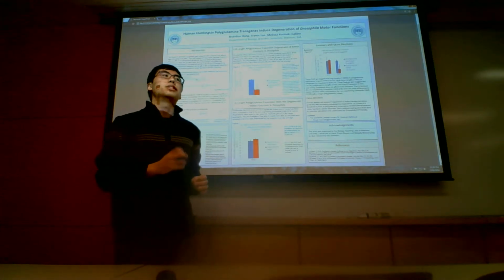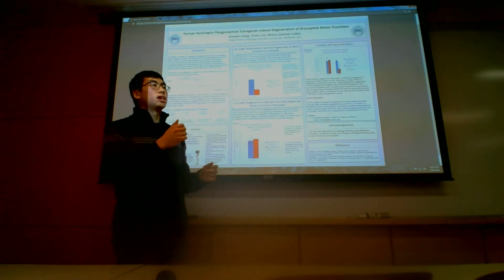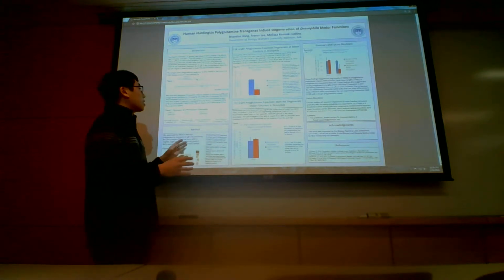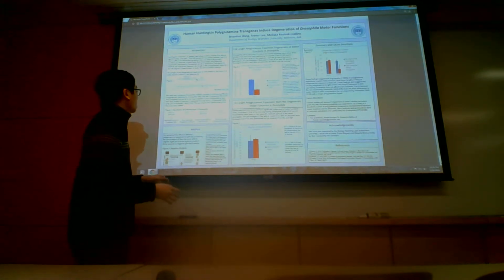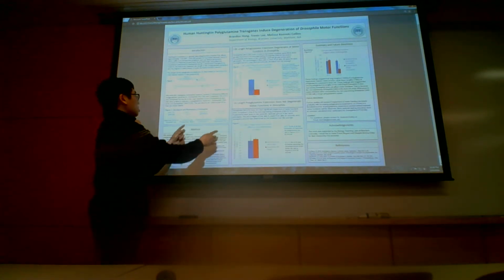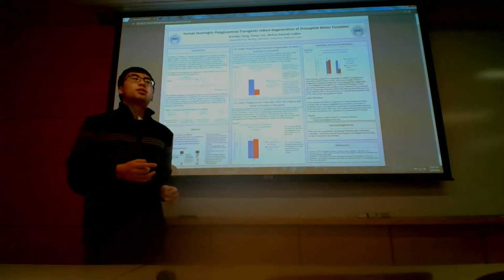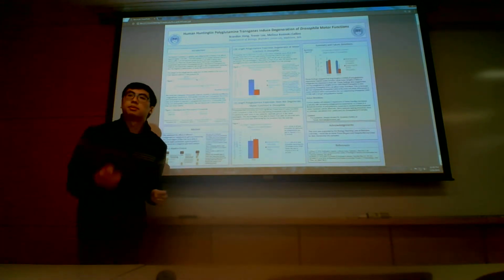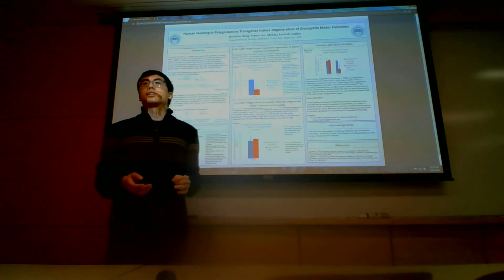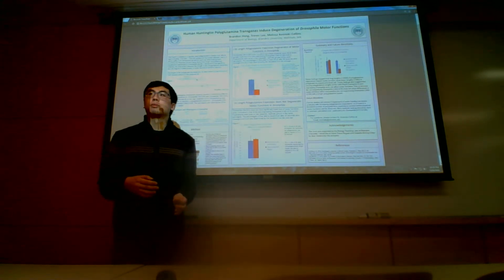And we varied the lengths of CAG repeats, which code for the glutamines, so that we could express HTT polyQ16 and HTT polyQ128 in Drosophila. Those two groups here are our experimental groups. These two groups here are our control groups. For our control, we used UAS polyQ, either 16 or 128. We chose these control groups because we wanted to make sure that the UAS polyQ system, the polyQ transgene, was not affecting Drosophila motor functions.